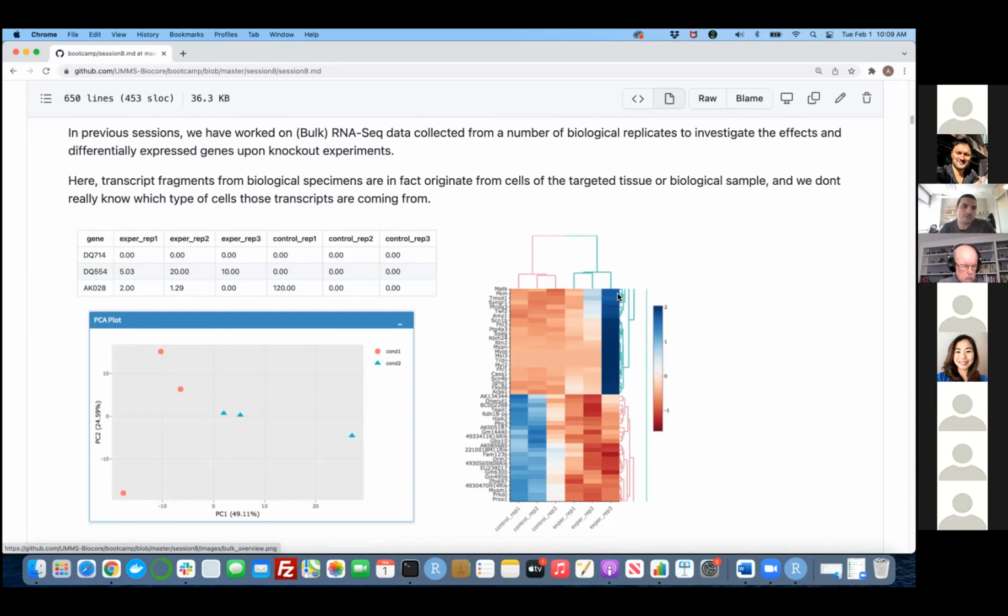By the way, in these lectures, we are not going to cover the analysis across different conditions, even though that's what we've been talking about, because it's a rigorous process to find out about different cell populations in your data. Sometimes you may have similar biological replicates in your data, but you're trying to find new cell types that may have different phenotypes. Since it's a little bit more advanced, we are not going to cover that, but we're going to cover until we have been able to find different cell types and annotate them. So why is this important?